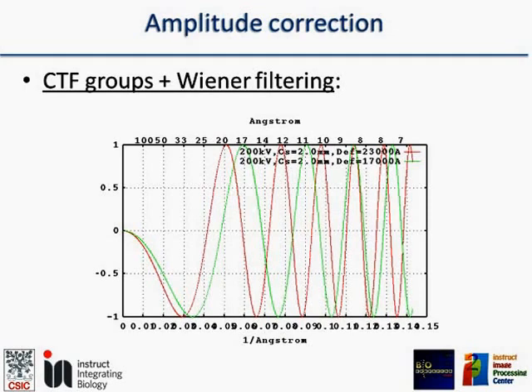So the green one would go into a different group, and you construct different groups. For instance, in the XMIPP, you can decide how strict you want to be with your groups. There are people who make one group per micrograph, people who gather several micrographs into a group, or you may do as you like.